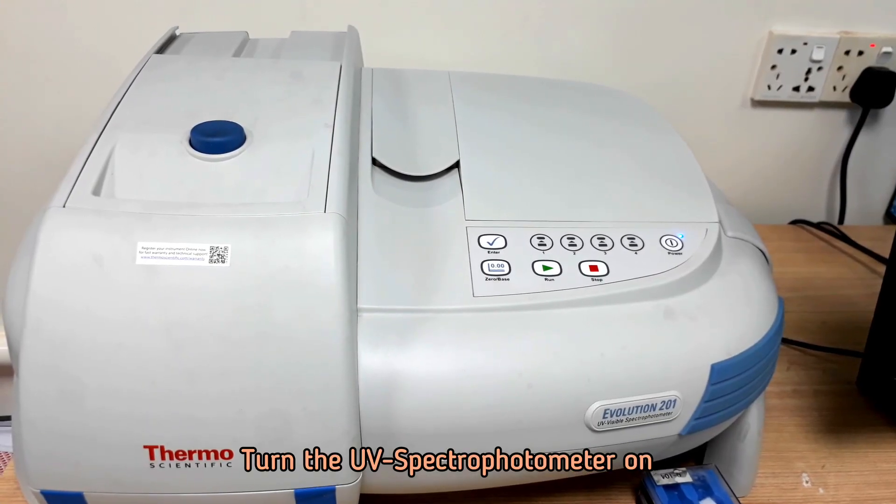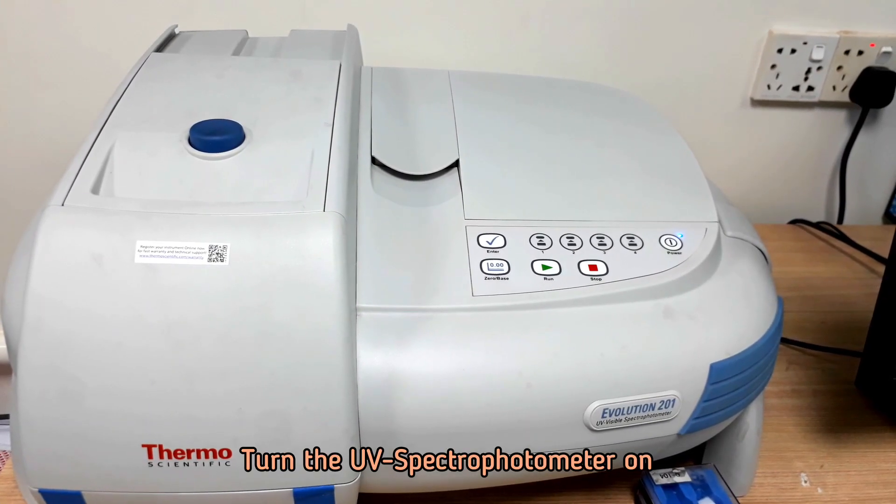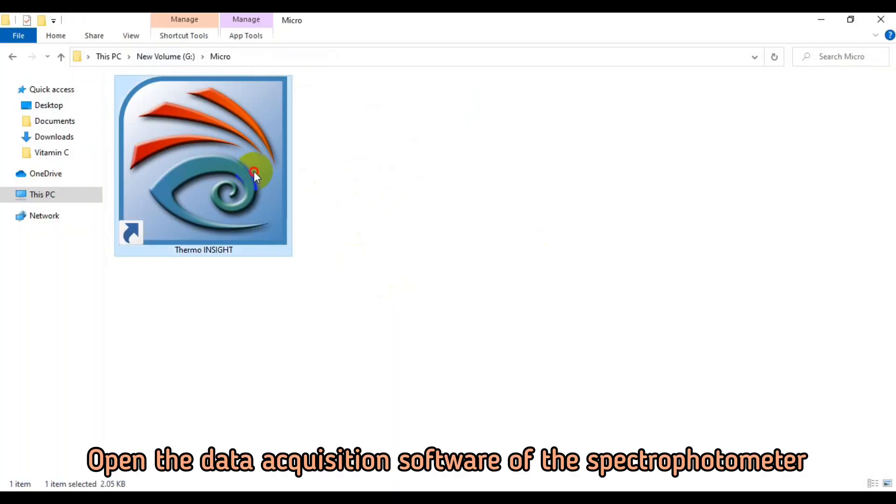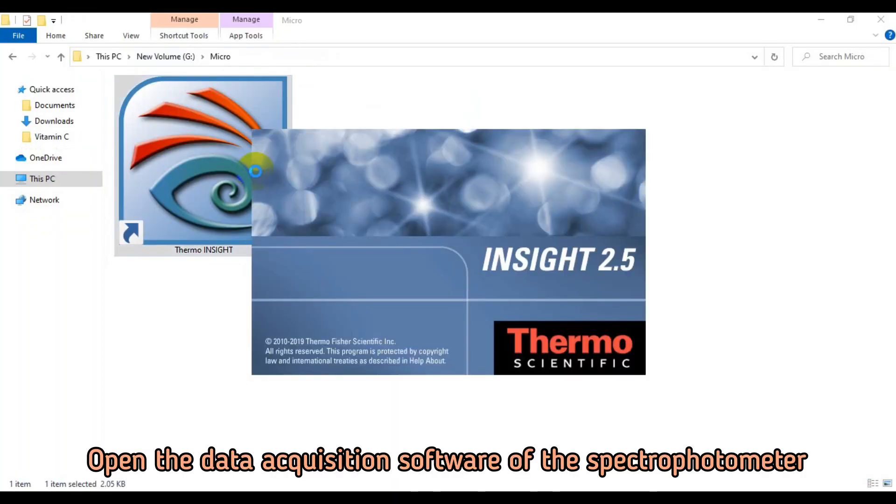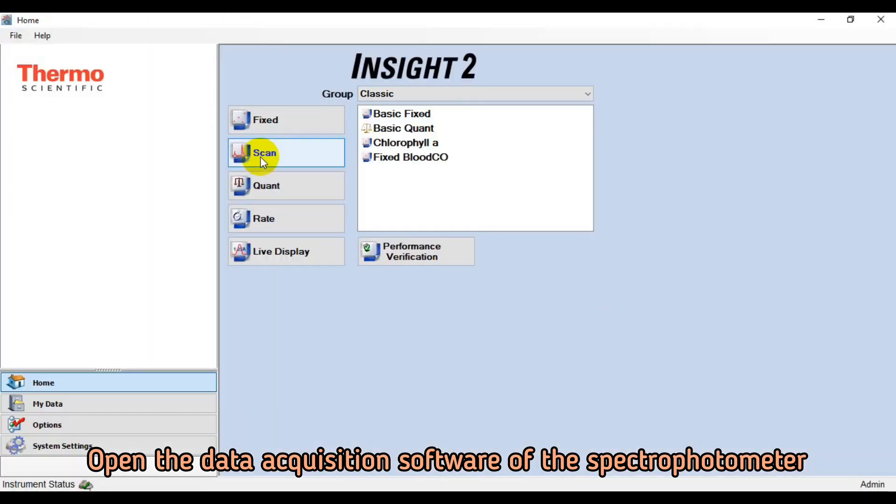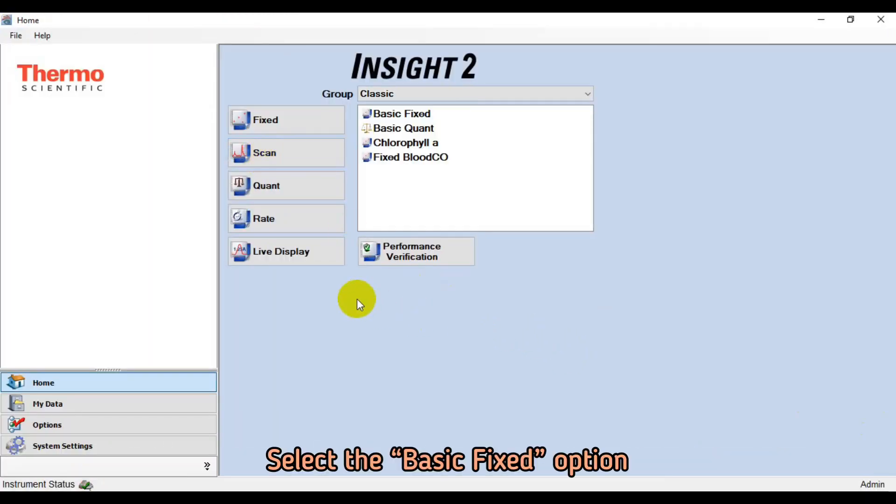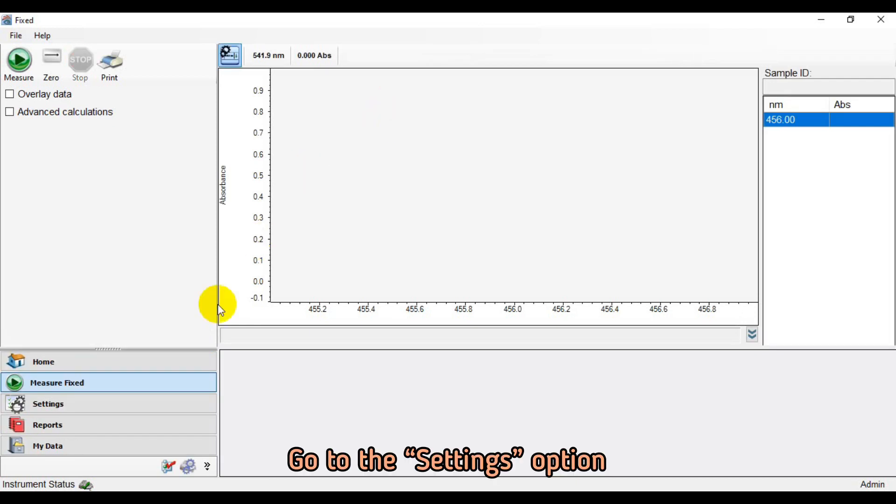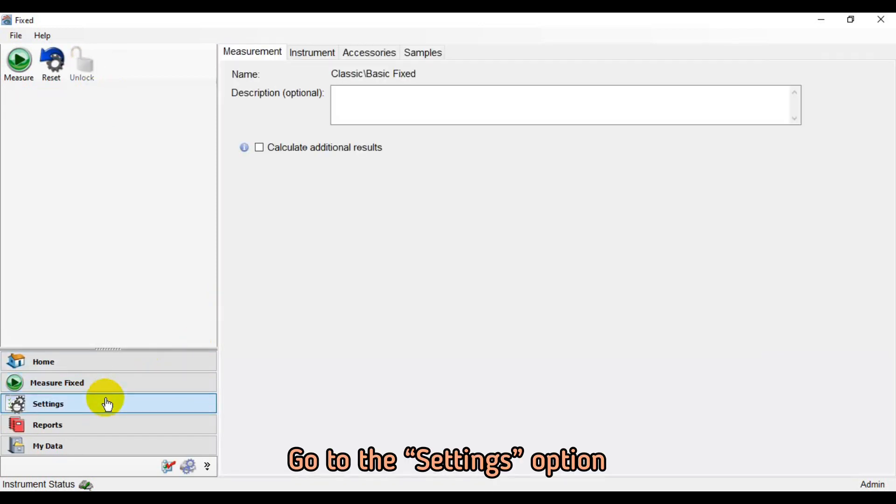Turn the UV spectrophotometer on. Open the data acquisition software of spectrophotometer. Select the Basic Fixed option. Go to the Settings option.